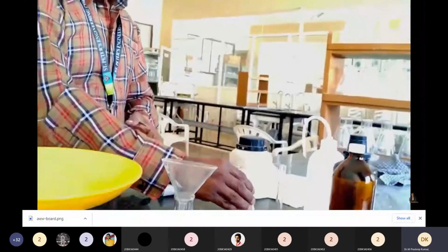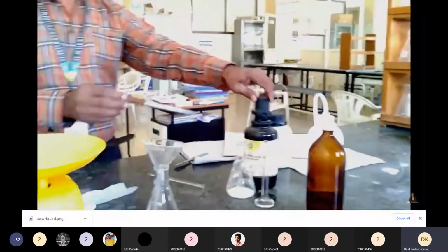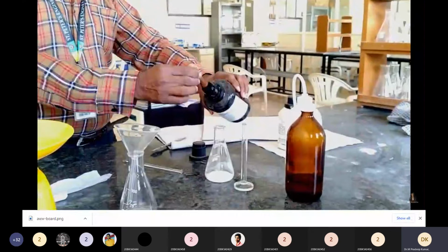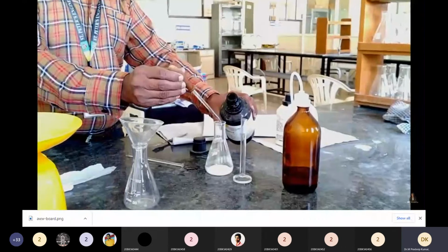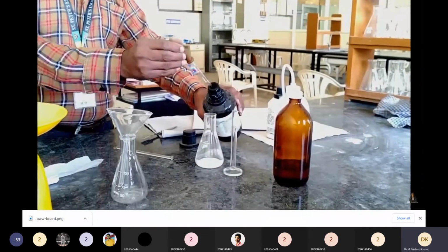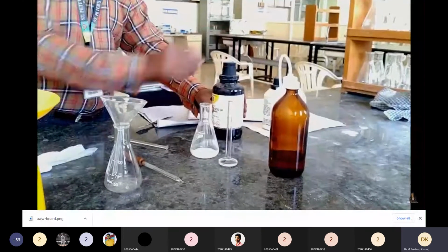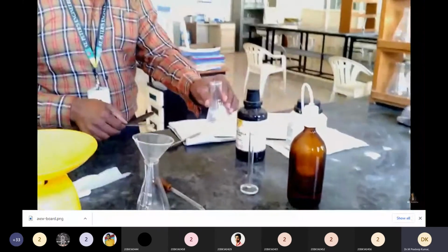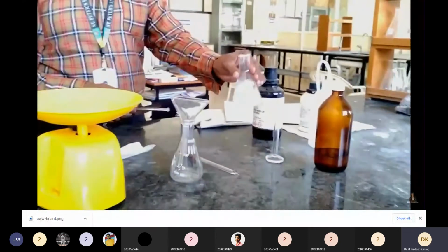Just a wet condition. So now, 5 drops of sulfuric acid we add. You take the dropper and add 5 to 10 drops, no problem. We also have to close it because these are dangerous chemicals. So just shake it. Here it is concentrated phosphoric acid, or in place of phosphoric acid we can use sulfuric acid also.